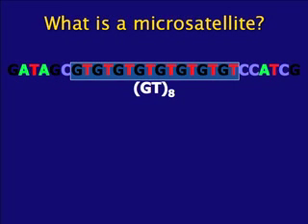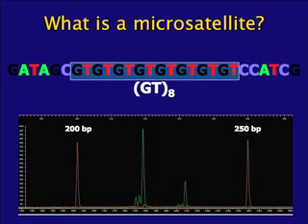We're using microsatellites, and microsatellites are simply a repetitive chunk of DNA. So we have a non-repetitive chunk of DNA on either side that we can use to anchor a primer, and we can amplify this repetitive chunk of DNA in the middle. We run that on an automated sequencer, and with some size standards that tell us how big that is, we can then score how big that microsatellite is in those individuals.